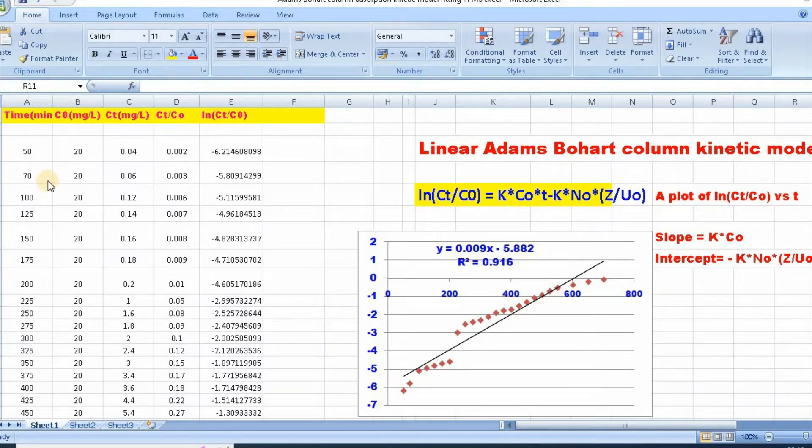In order to fit, I have taken data for time, initial concentration C0, and outlet concentration Ct at time t. Then, we need to convert Ct divided by C0. I have just converted equal to Ct divided by C0. Then, scroll down this.